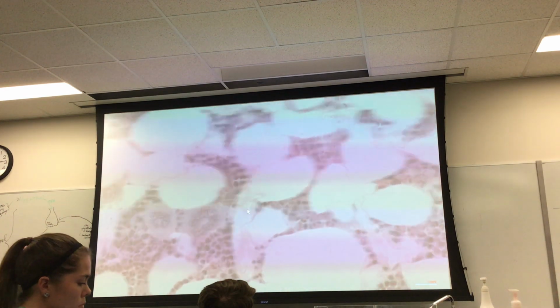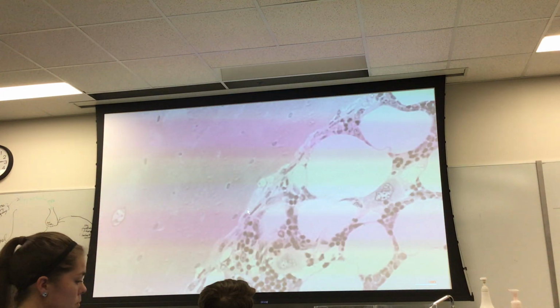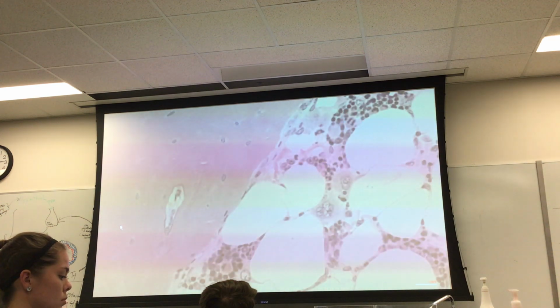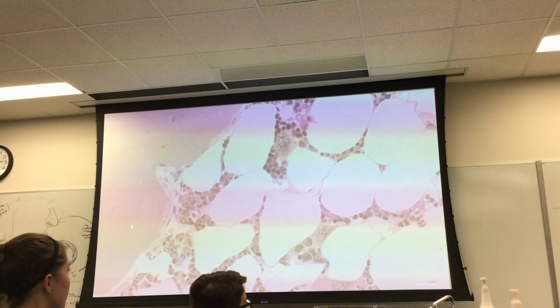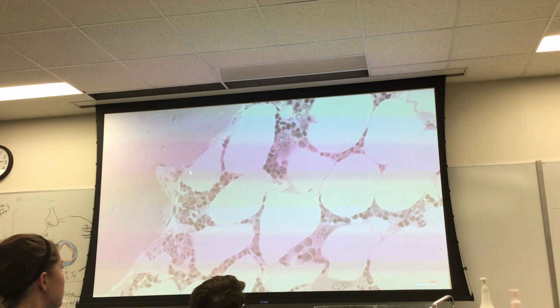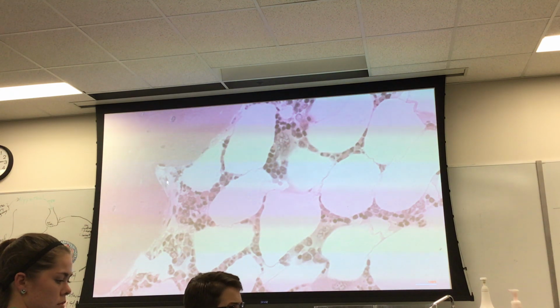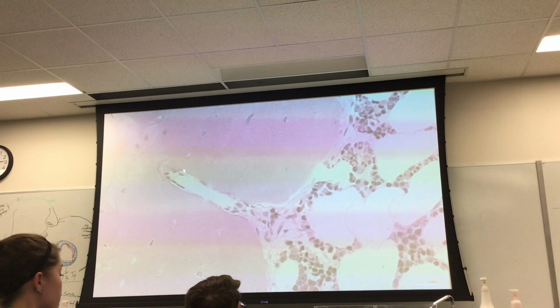But when you come to the interior, that is the marrow cavity, this is marrow, this is the endosteum, and you might expect to see more primary canals in here. But also remember this other term. It's called a Volkmann's canal. It's where you have this indentation into the bone matrix, usually from a marrow cavity. And it's the pathway by which blood vessels run inside to gain access to primary canals as well as haversian canals. Yeah, here's the really nice one right here. So this is a nice Volkmann's canal right here.